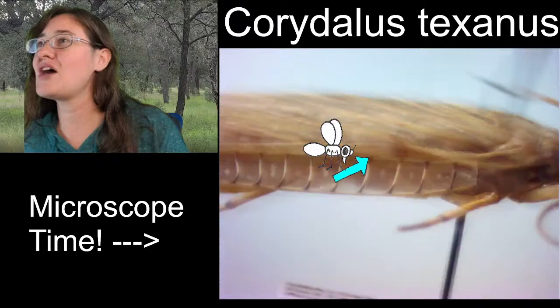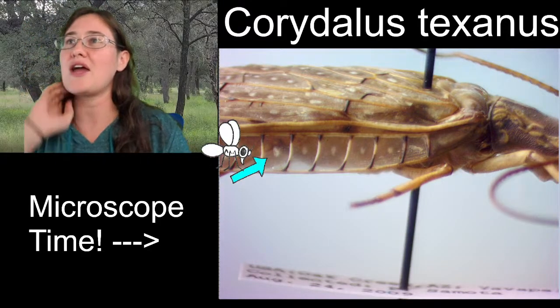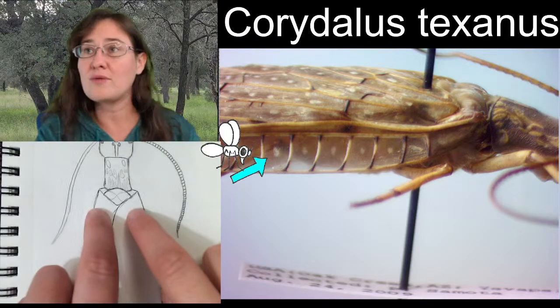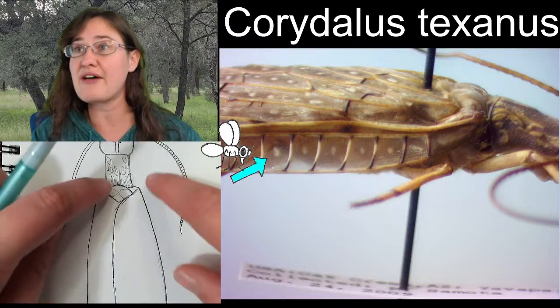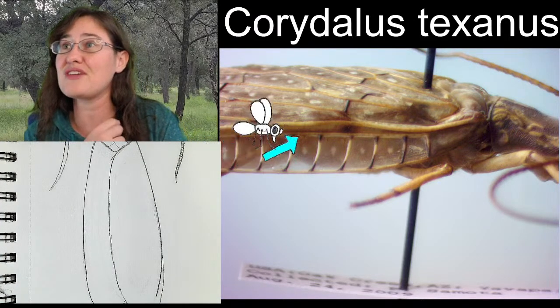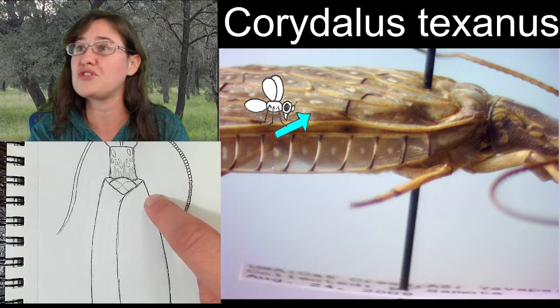All right, so this is one of those things that kind of messes with your head when you're sketching too, because when we're looking at these angles, these hard solid lines right here on our edges are actually this vein up here on the top, this one that folds down.